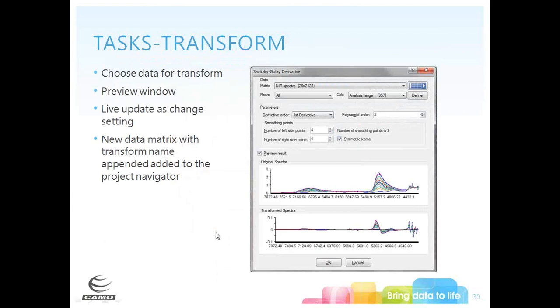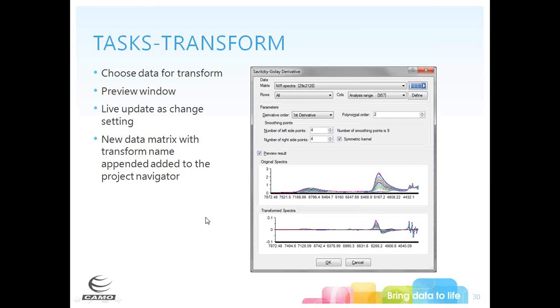A commonly applied signal processing transform is the derivative transform. For a Savitzky-Golay derivative, you define the matrix, rows, and columns to use, choose the derivative order from first to fourth, and the number of smoothing points. Checking the preview box gives a live update of the result as you change settings. A new data matrix with the transform name appended is added to the project navigator after clicking OK.